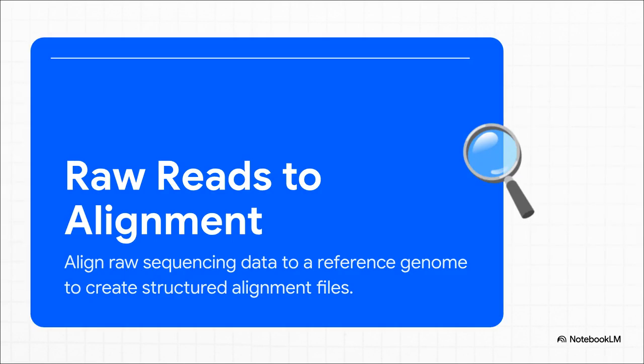So step 1 is all about taking those millions of tiny shredded reads and mapping them back to a known reference genome. It's kind of like taking all those ripped up sentences and carefully pasting them back into a master copy of the book right where they belong. This gives us our first really structured file, which is called a BAM file.